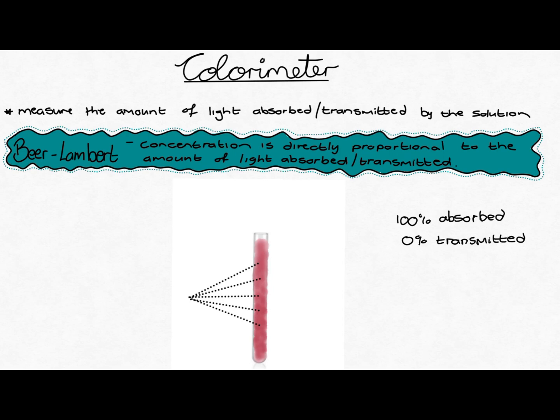But black, being the darkest color, means that all of the light is being absorbed, and black means the absence of light. So as the color intensity increases or darkens, it means the absorbance increases and the transmittance decreases. So we can add a numerical value to this color change to determine the rate of reaction of the enzyme.